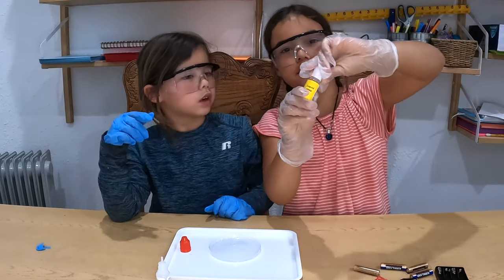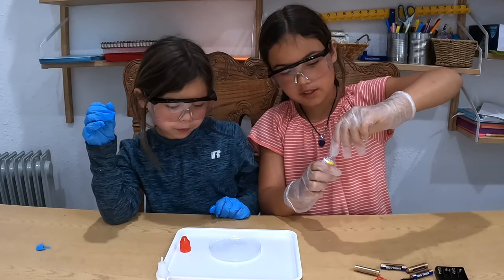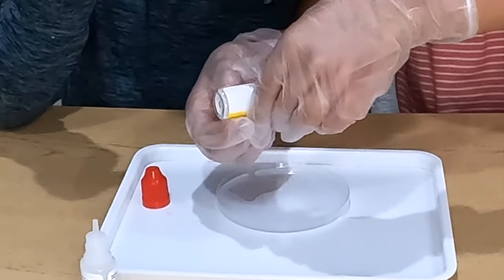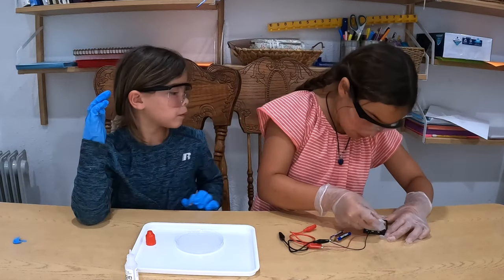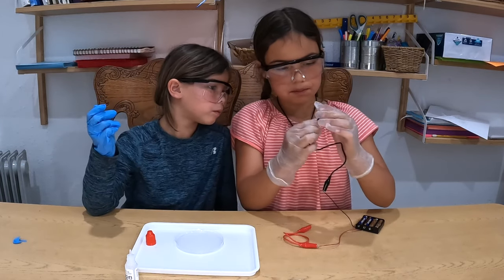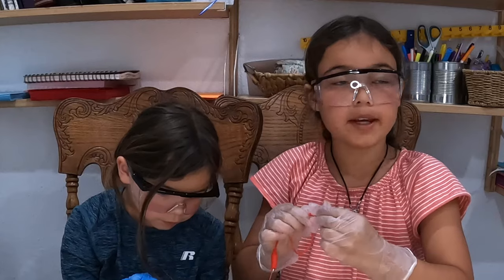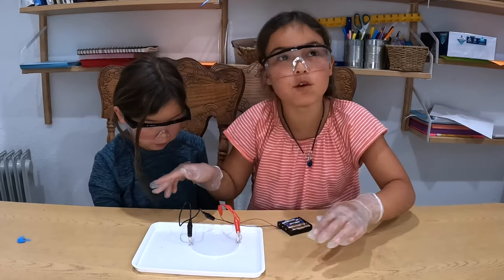Get the liquid soap and pour two drops of it in so it will spread equally — just two drops. Then get the batteries inside the battery pack. Connect the crocodile clips — the red needs to be on the opposite side of the black. Make sure that the liquid is touching the metal clips.